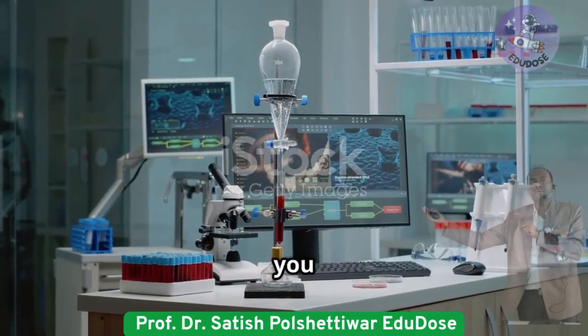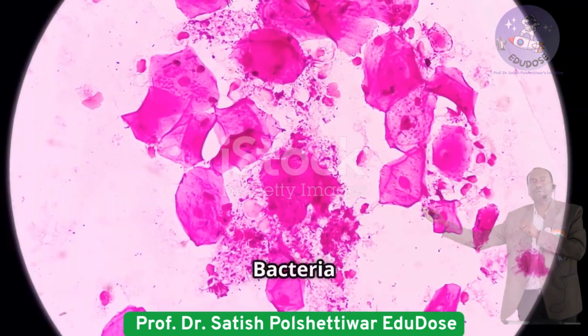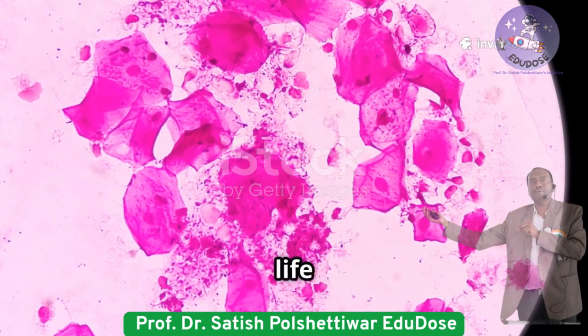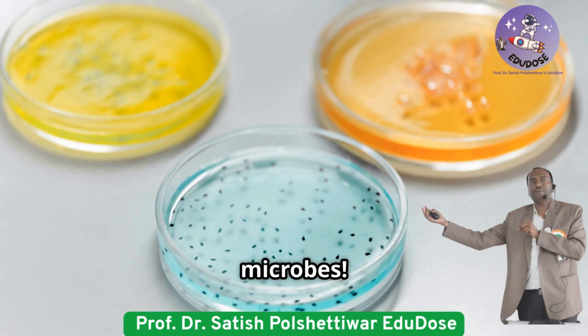Today, I'm going to walk you through a fascinating and foundational topic in microbiology: staining of bacteria, including its types, step-by-step procedures, and how we bring these tiny organisms to life under the microscope. Let's dive into the colorful world of microbes.